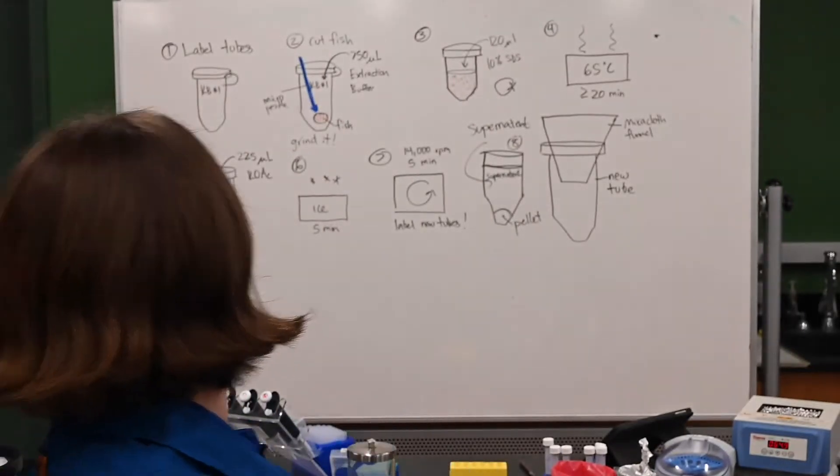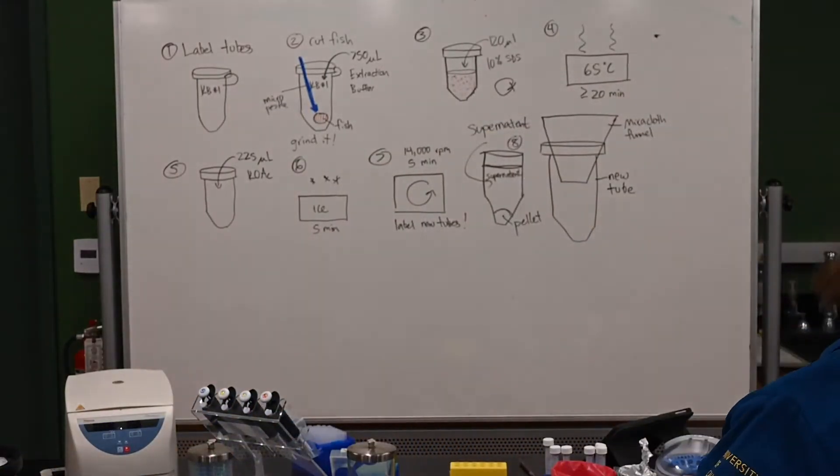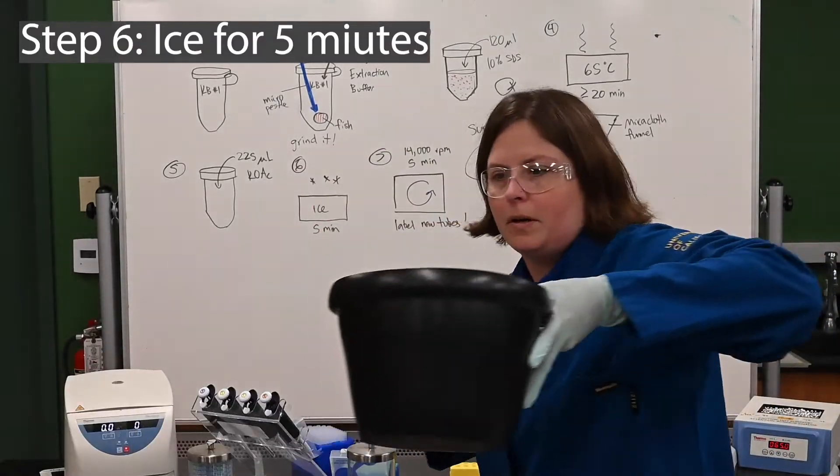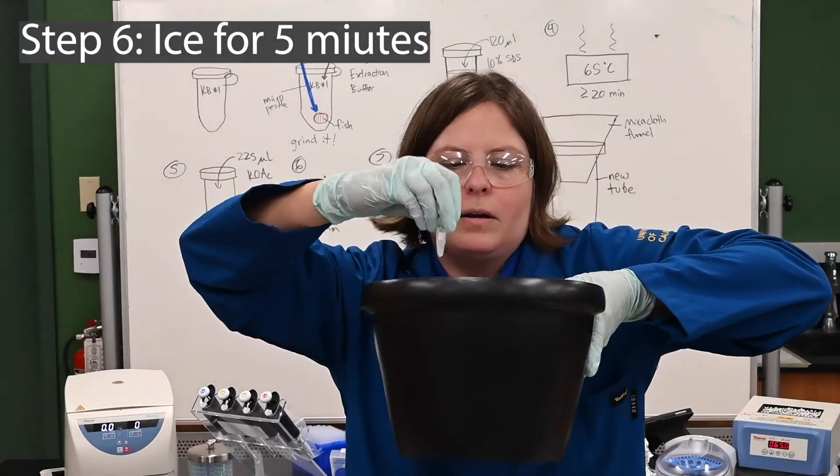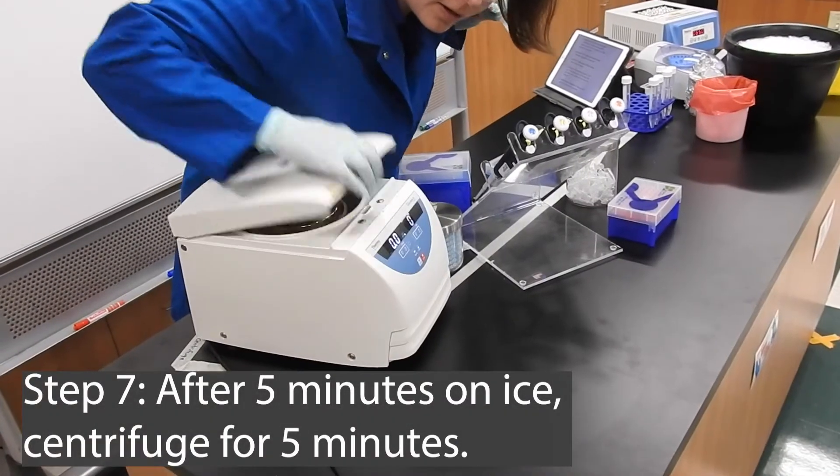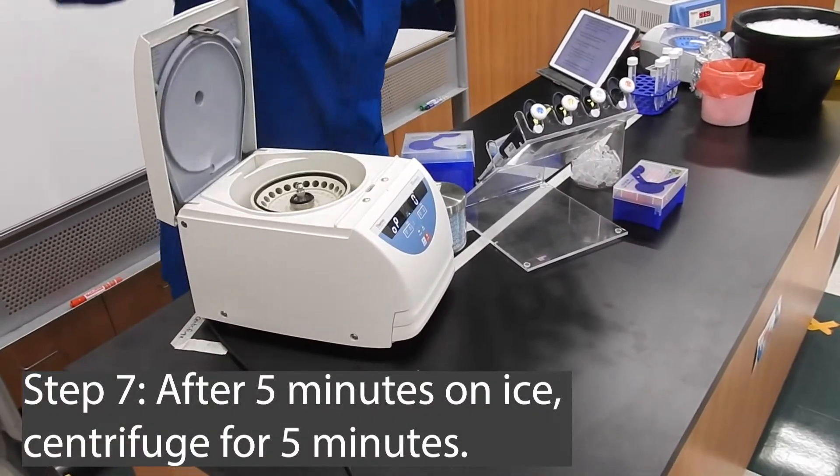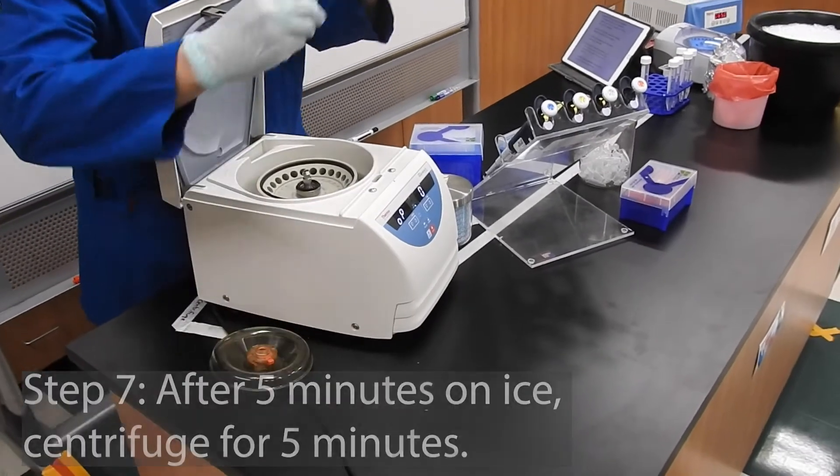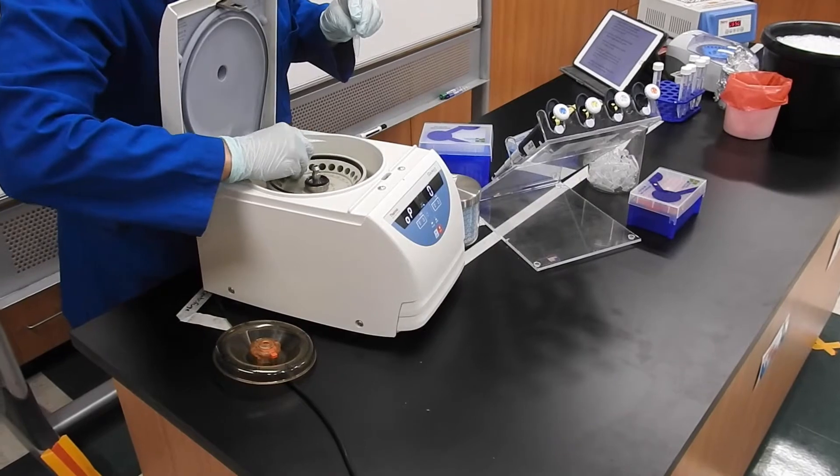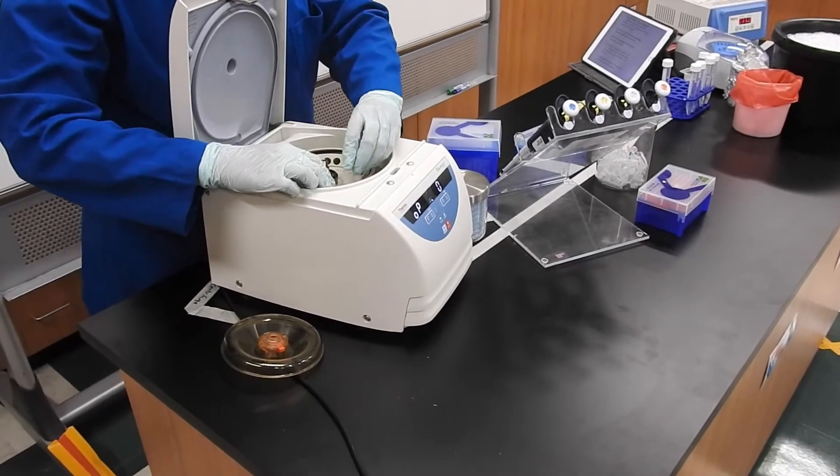Next we put it on ice. So we're gonna chill it down. Got my ice bucket. One, two, five minutes. I'm going to open, take off the lid. And this is very important, if you ever do this in person, I'm going to put these across from each other so that the weight is balanced in my centrifuge.